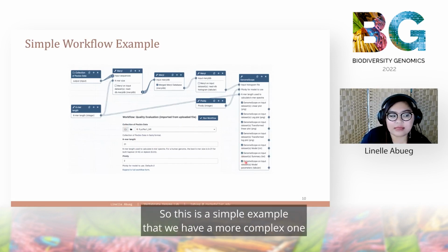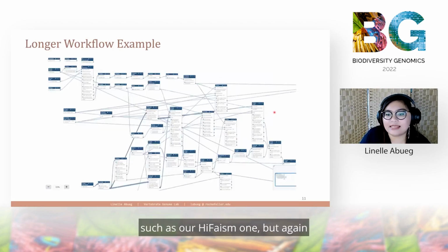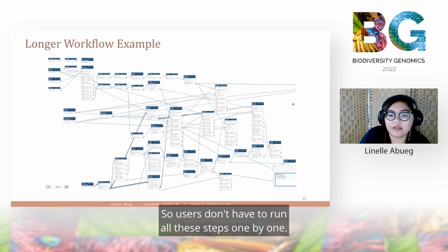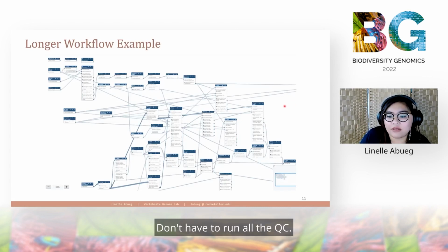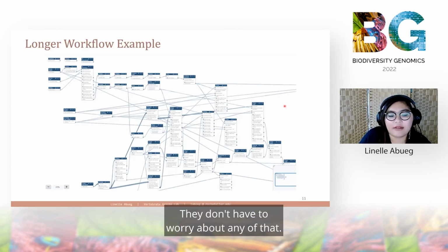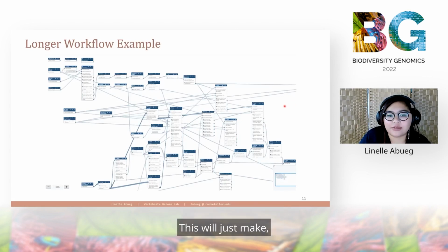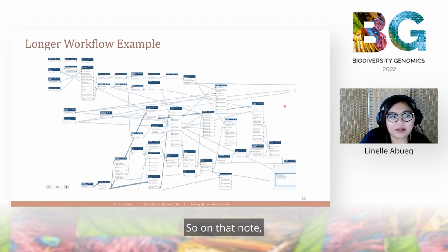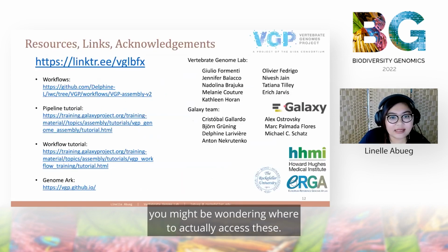So this is a simple example, but we have a more complex one, such as our HiFiasm one. But again, all this is in the back end, so users don't have to run all these steps one by one, don't have to run all the QC, they don't have to worry about any of that. They just put in their input data and they will get their contigs and their Merqury plots and so forth.